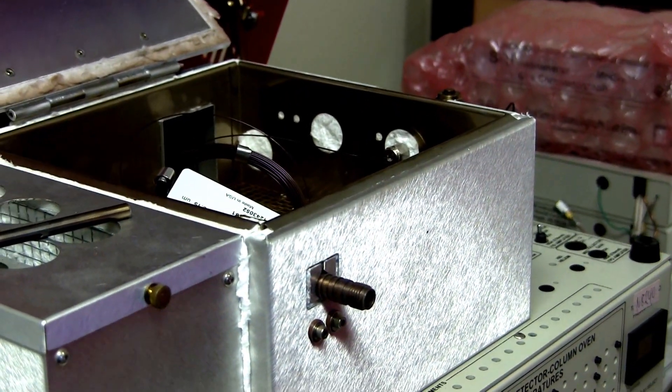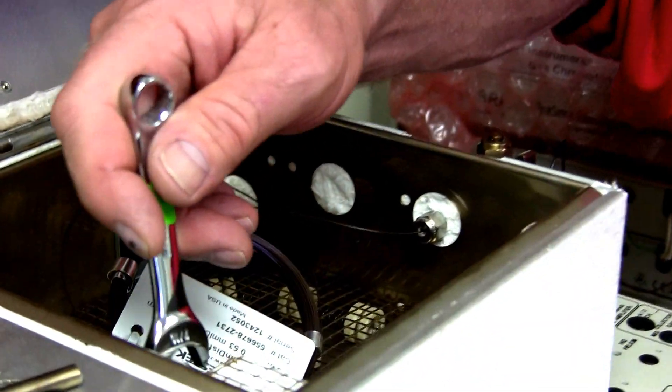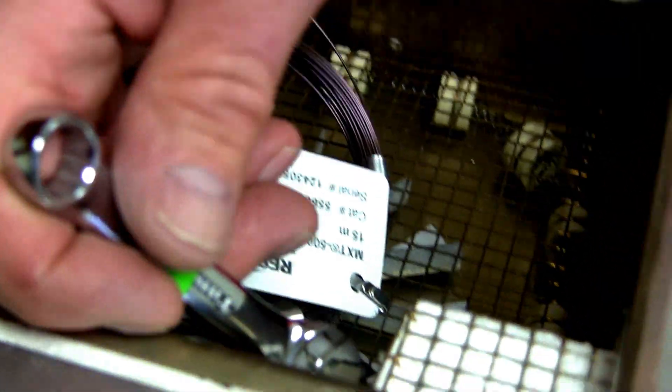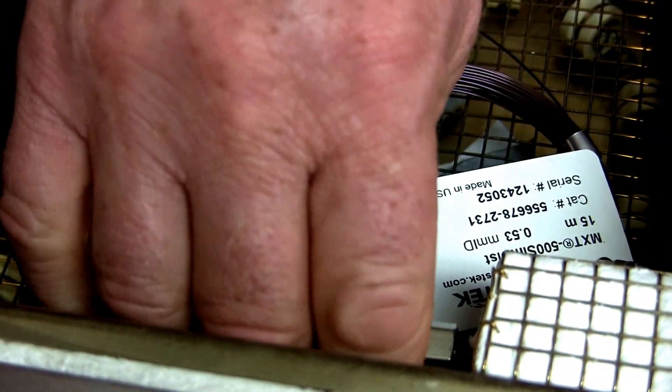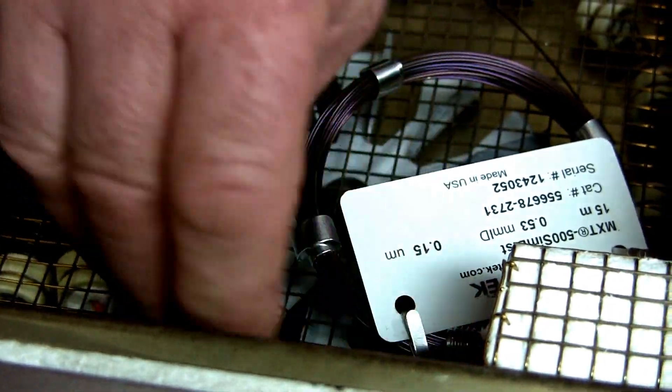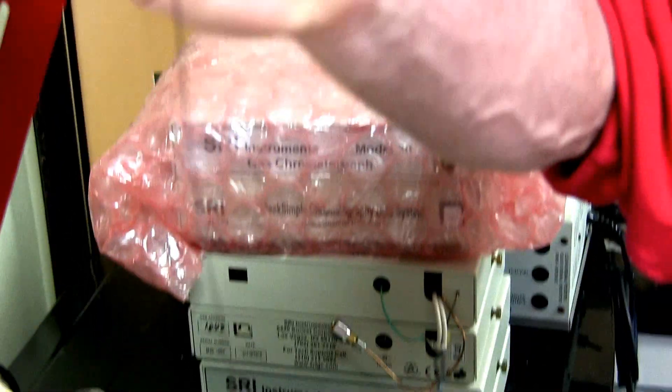The column now is connected to the inside of the injector. So I'm taking my 7/16 wrench and I'll loosen the nut and ferrule that hold the column, and then remove the column from the injector.